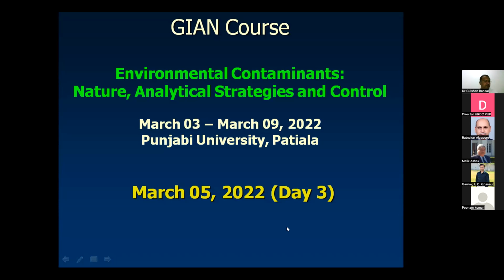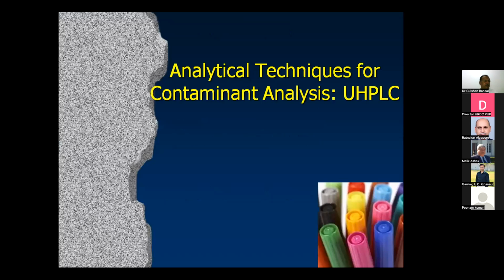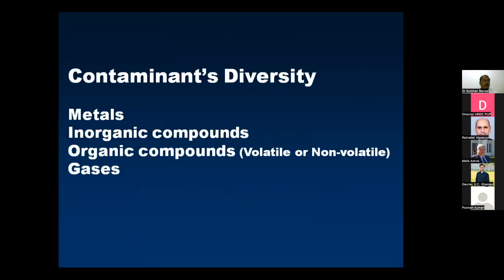So coming to the first session, analytical techniques for contaminant analysis, that is UHPLC, ultra high pressure liquid chromatography. So contaminants diversity: we have seen in the last 2 days that the contaminant diversity is very vast. There can be metals, then there are many inorganic compounds, then there are numerous organic compounds.